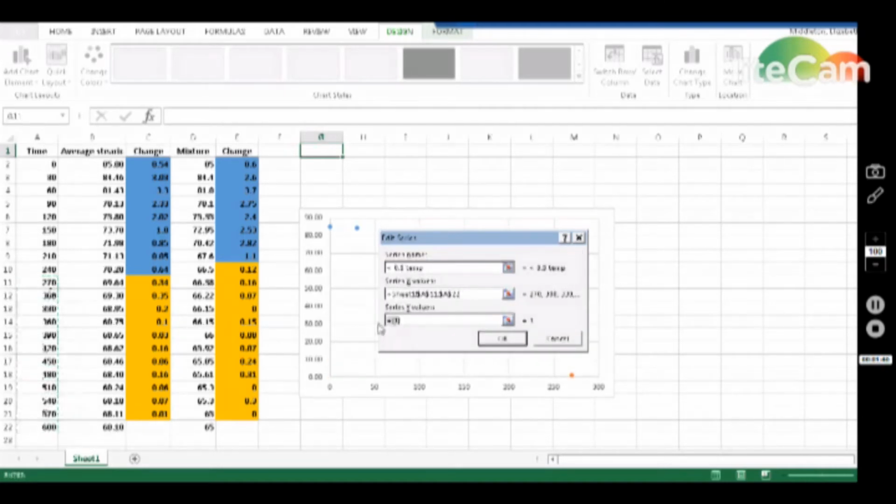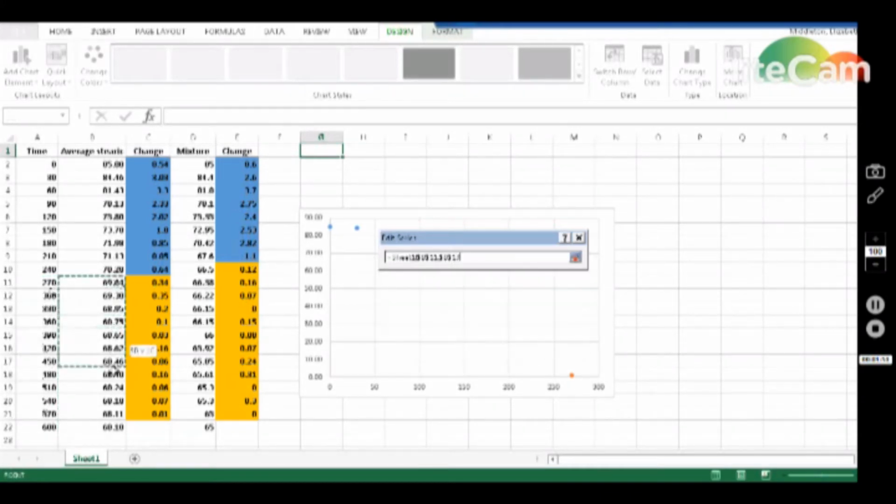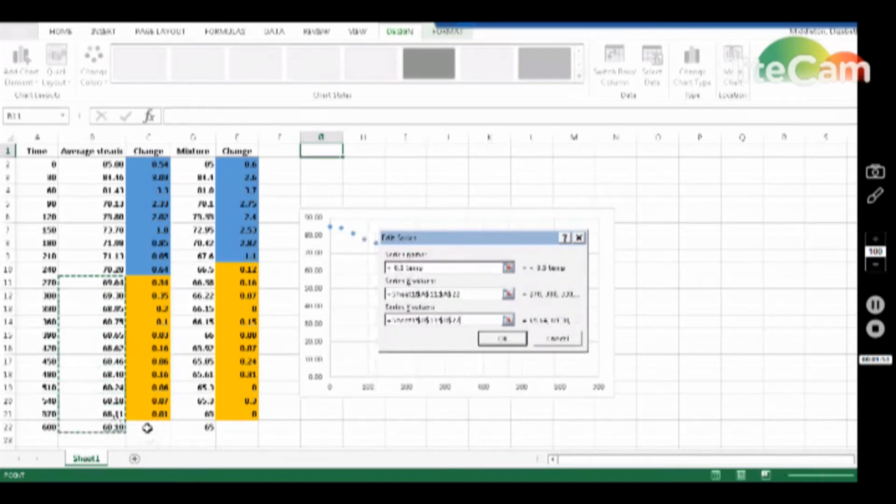You can see that the temperature of the stearic acid slowly decreased over time, and it decreased more and more slowly as time progressed.